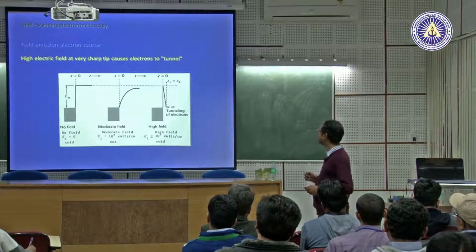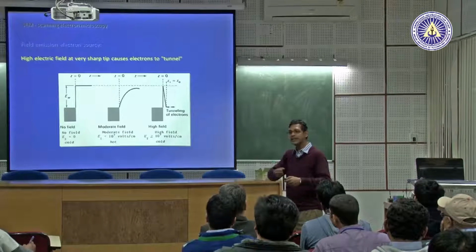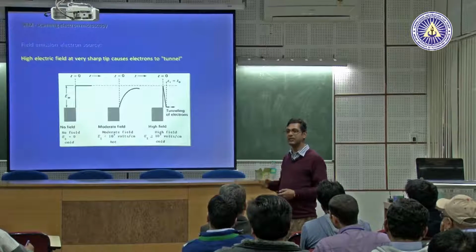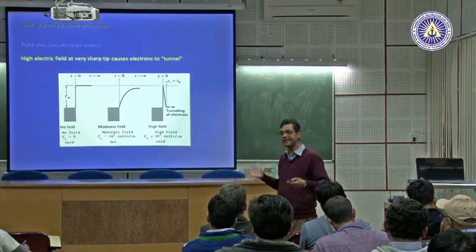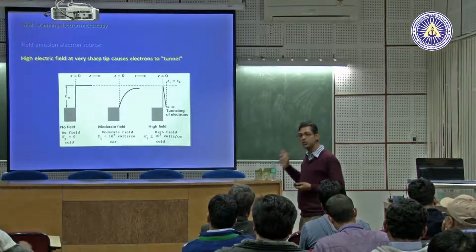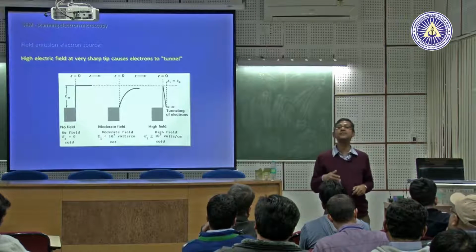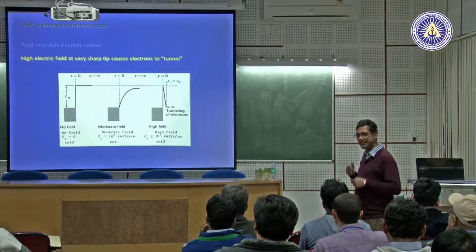That is the one thing. The second thing is that, depending on your source and the voltage, you can draw more electrons. You can have a larger number of electrons per unit area. With tungsten you cannot do that. You can keep on heating it up, but after some time it will melt. That is the problem with tungsten. So there are the two basic advantages. That's why all these SEMs nowadays come with a field emission gun. These are called field emission gun sources. It has many advantages.